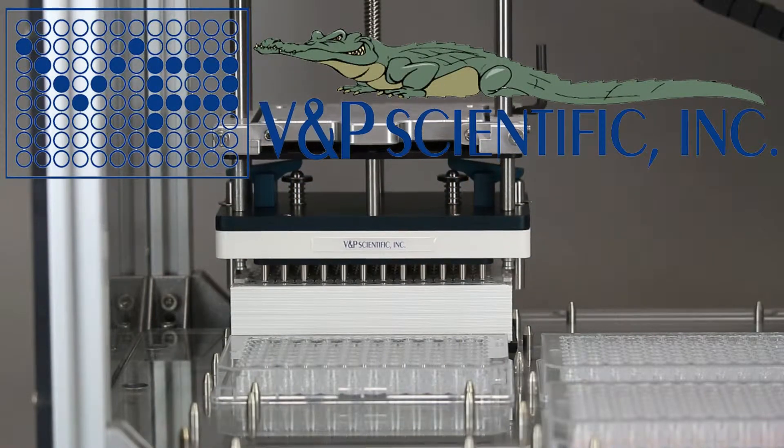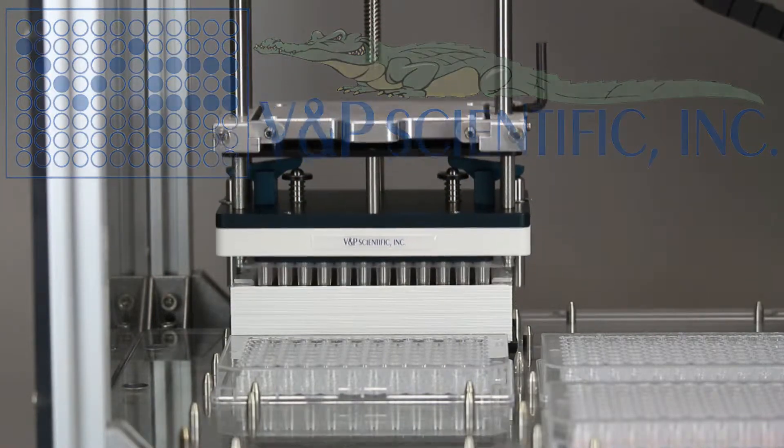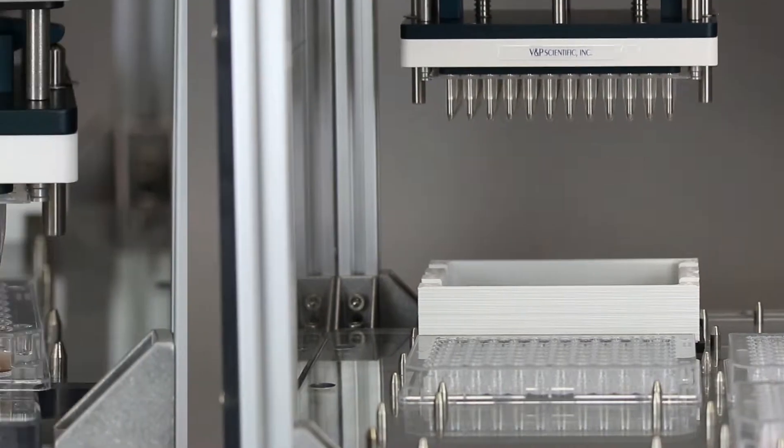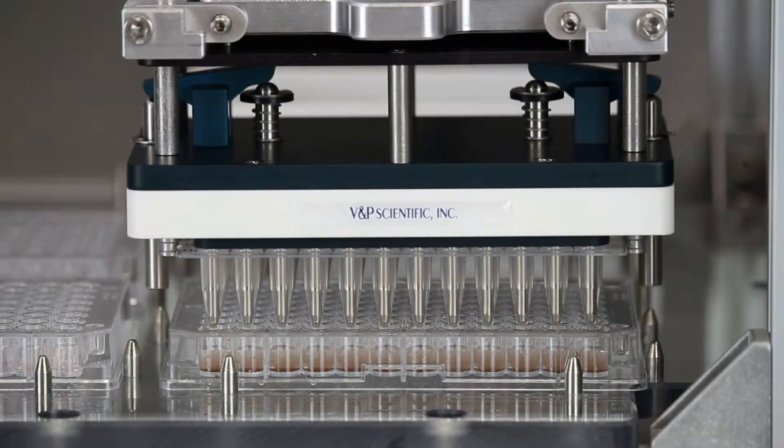The Magpin R automates your magnetic bead assay by allowing you to use your liquid handler to process a magnetic bead wash protocol.